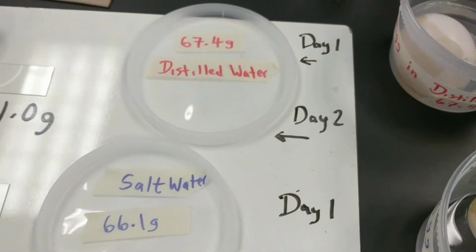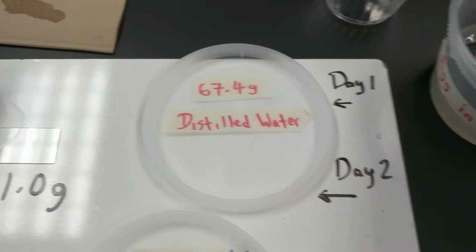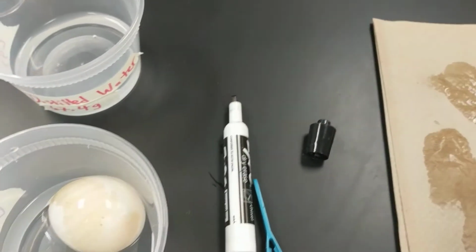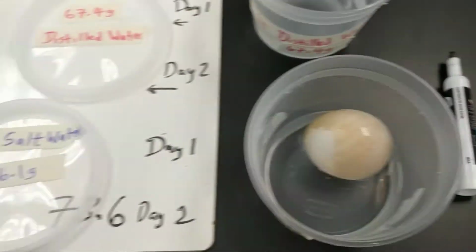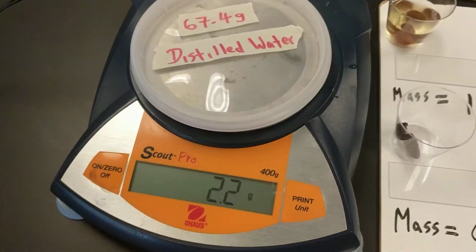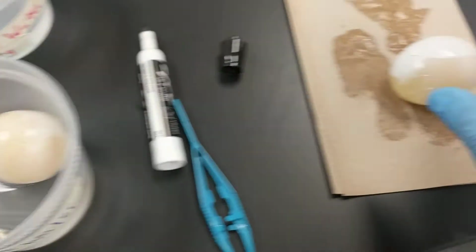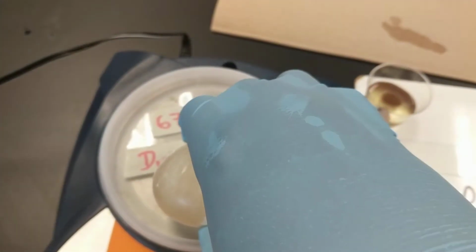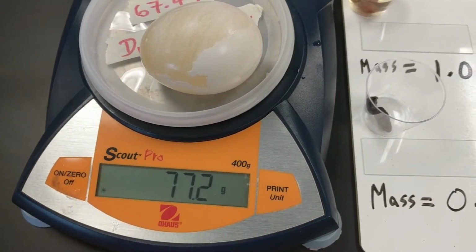And the same one for distilled water. The original mass was 67.4 grams. Remove excess water. Want to zero the balance, and take the egg that was placed in distilled water. And the new mass is 77.2 grams.